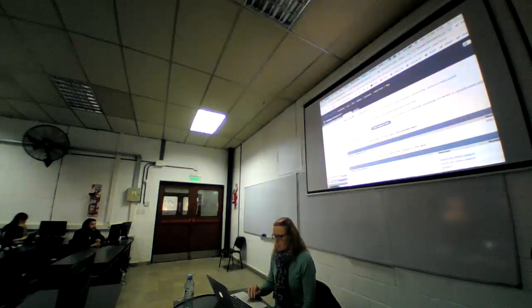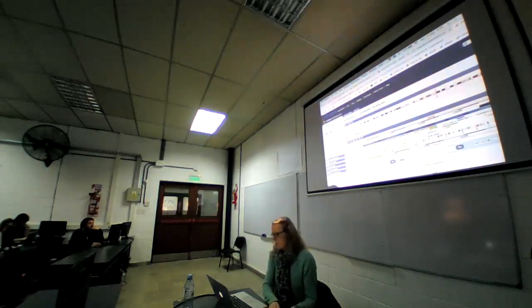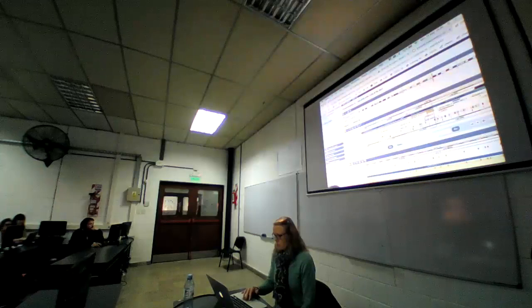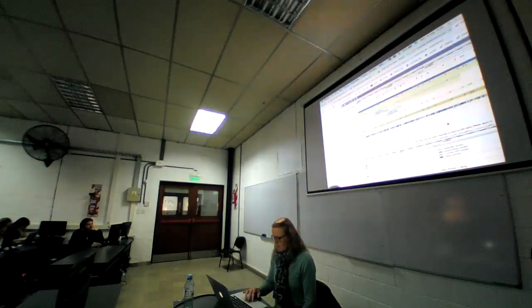So now I'm going to go to the location tab by just clicking on that tab, and look at variants in the wider region here. In this view, which should look familiar to you now, we have 2 variant tracks which are on already. One is this one here for 1000 Genomes, all SNPs and indels. In this track, all of these lines are individual variants which were found in the 1000 Genomes project. There's a legend at the bottom, again with the colors, and you can click on them and get to the pop-up window as well. There's another track with phenotype associated variants just below that.